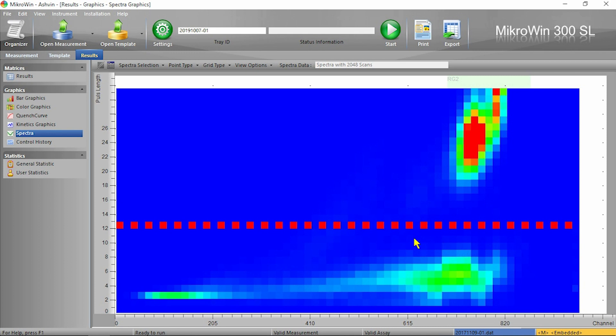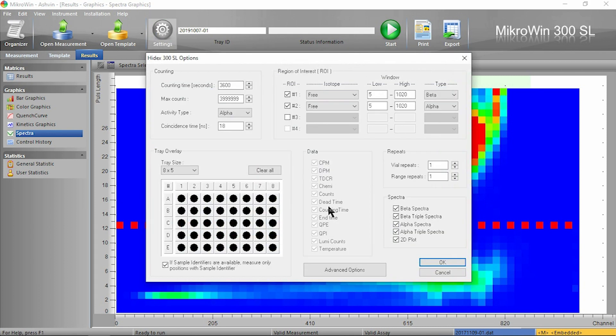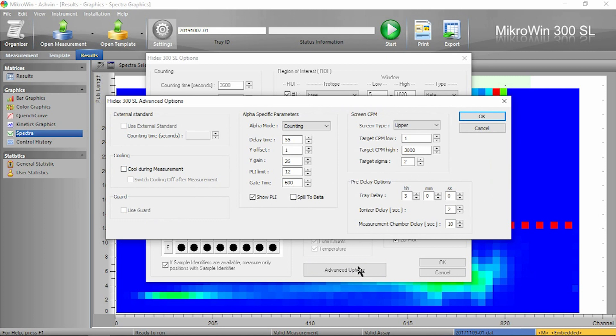The PLI setting can be adjusted in Settings, then Advanced Options, then PLI Limit. If I'm using an Ultima Gold or Synth Logic cocktail, I can change this to around 6 to 8 depending on the separation.